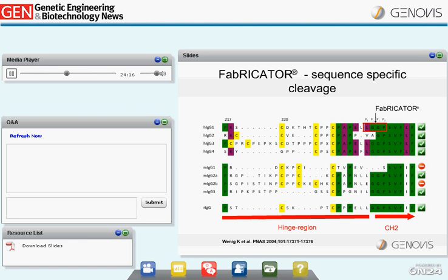The exception is human IgG2, where cleavage takes place between the alanine and glycine. The rate of cleavage is much slower on IgG2, which indicates the difference in cleavage susceptibility between the LGGP motif found in the other human subclasses and the VAGP motif found in IgG2s.